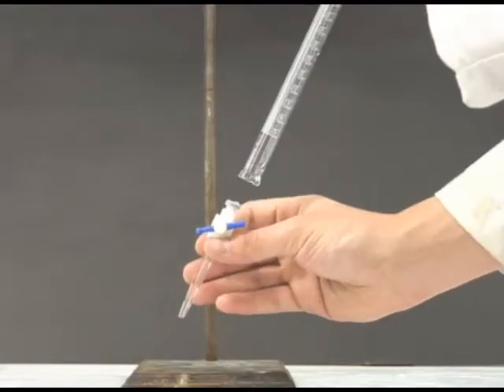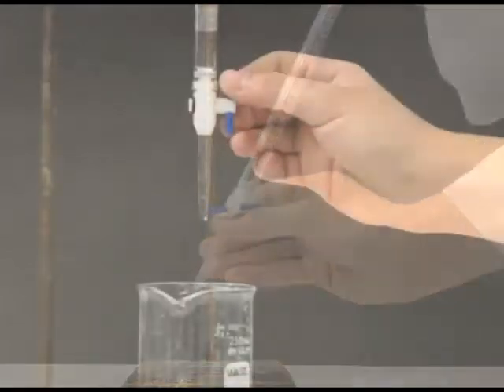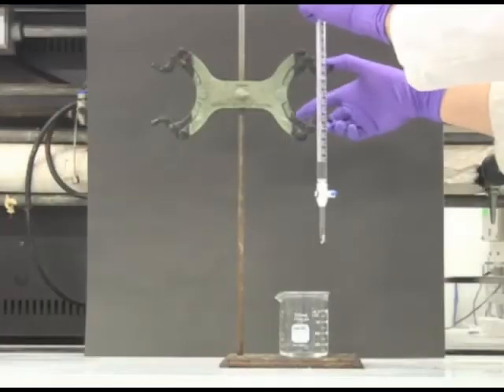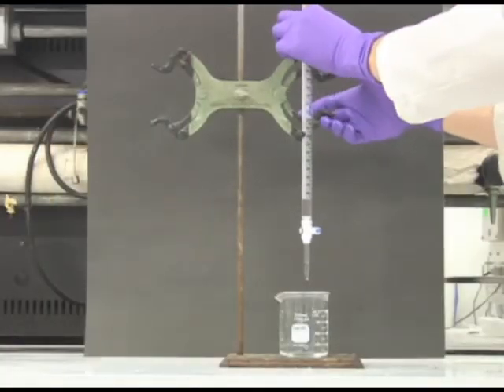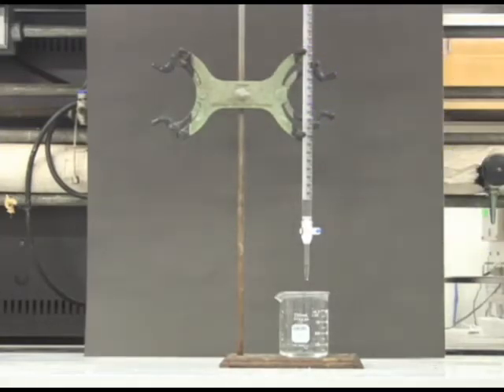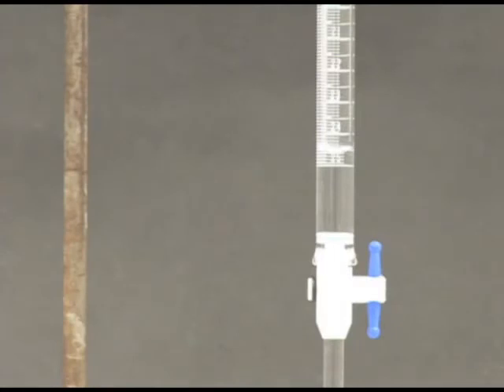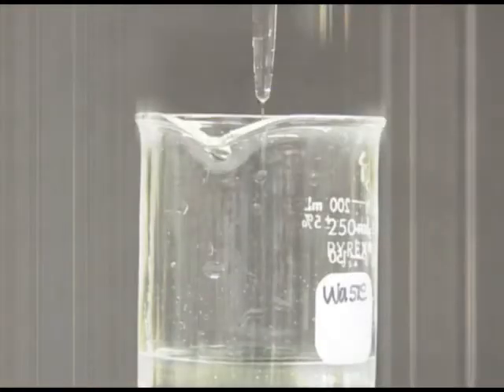Replace the tip, make sure the stopcock is closed, and add a few milliliters of distilled water to the burett. Place the burett in the burett holder with a beaker below the tip. Open the stopcock on the tip and let the water drain through the stopcock. The water should drain from the tip in a steady stream.